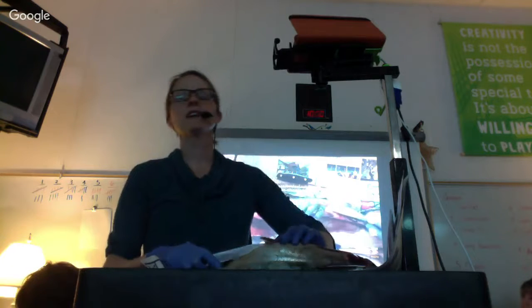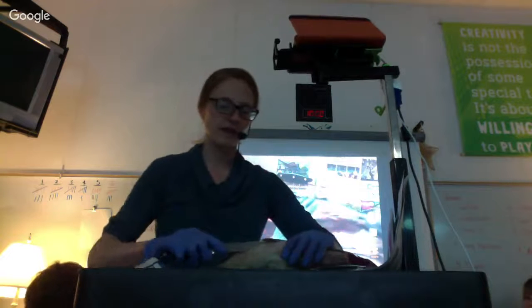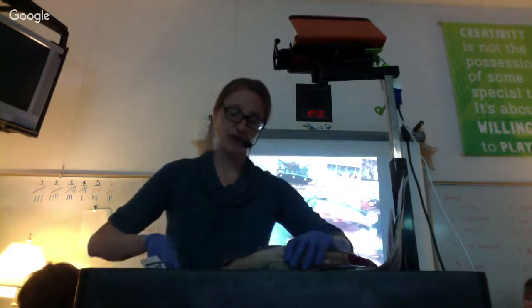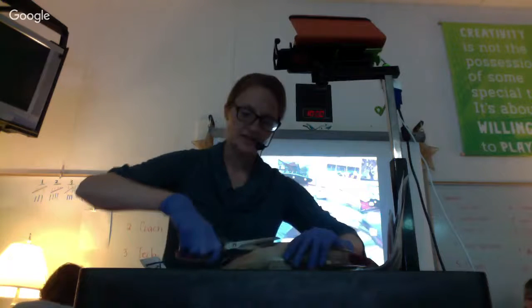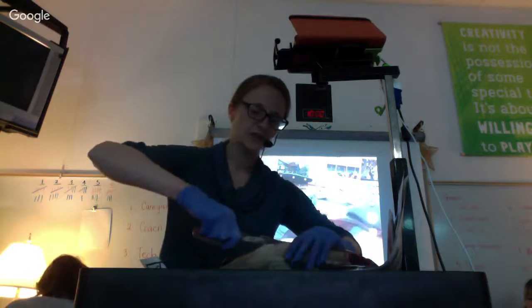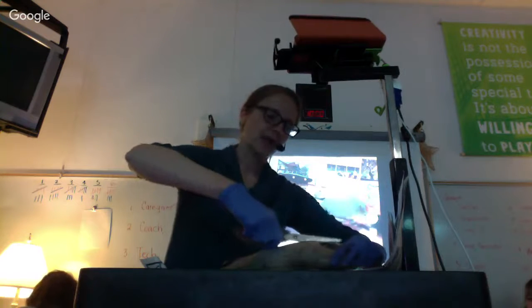We have all the different organs, including the swim bladder. Well, it's more up here. But if you're too forceful, things can pop and things may not end up the way they should be. So I'm just going to use a pair of scissors here, and these are just kitchen scissors. We have a few of them lying around here, which actually might help for those people. And we're going to open up.